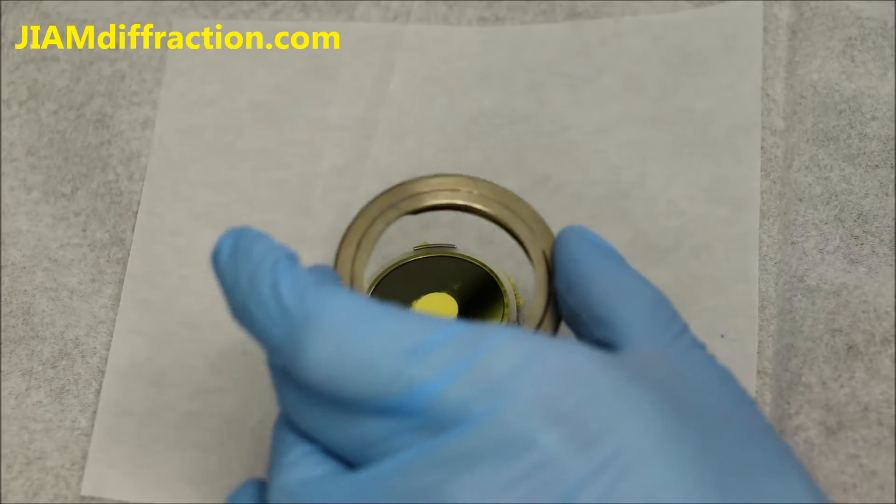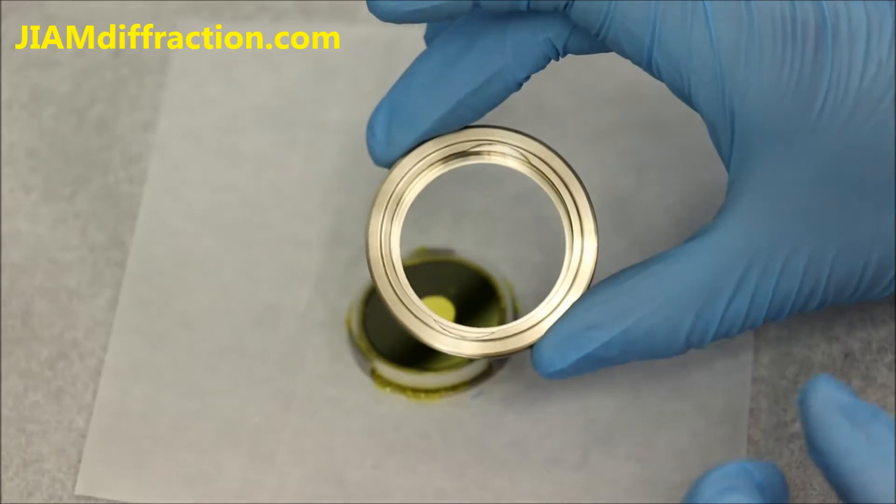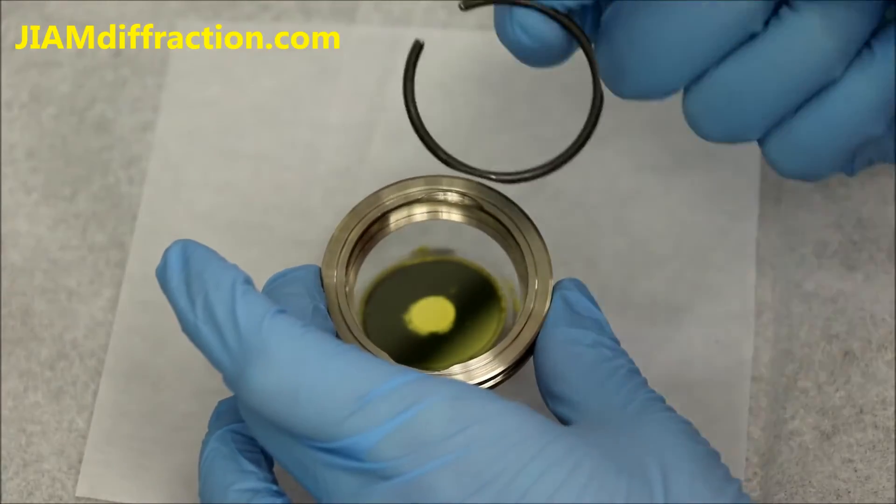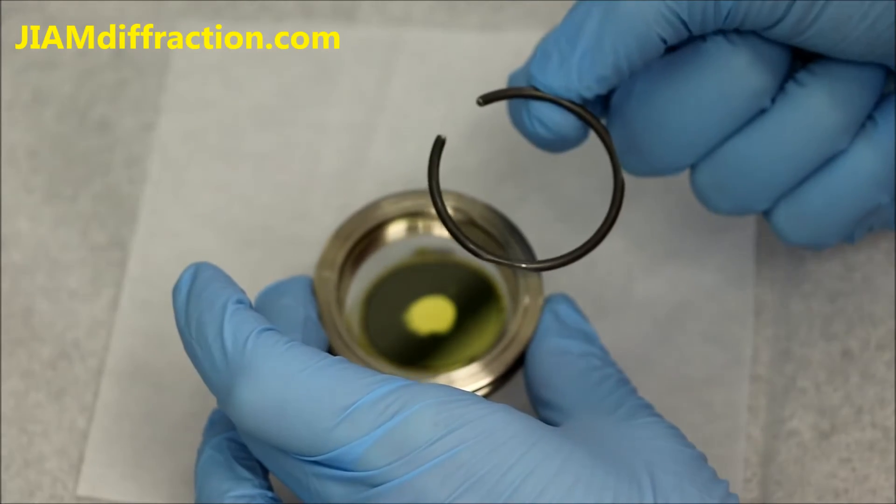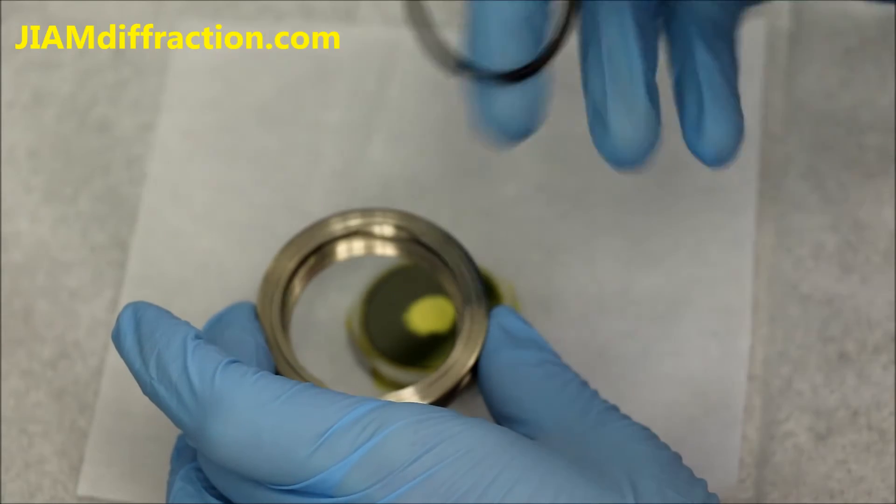But next we need this outer part of the sample holder. And if we look at it we will see that there are two notches cut in it. And this piece, which I did not show you before, the securing ring, will go inside here to lock the sample in place once we put it in.